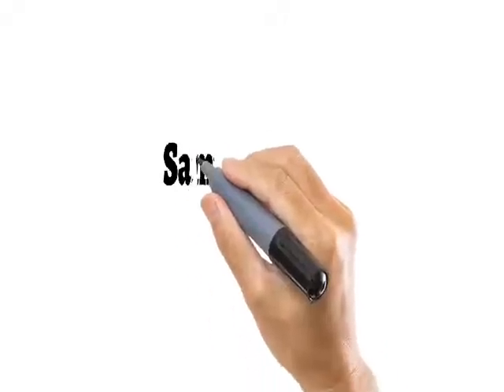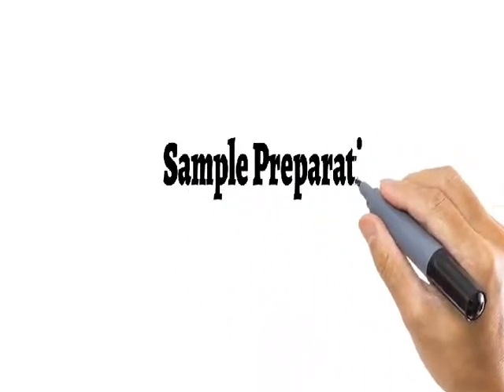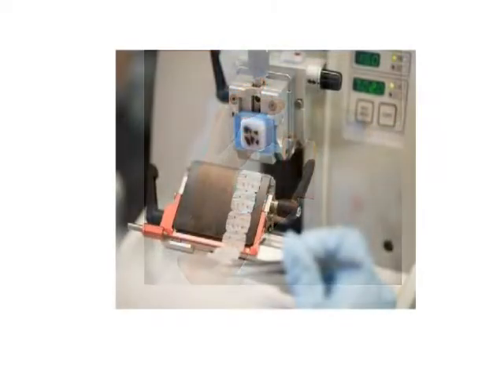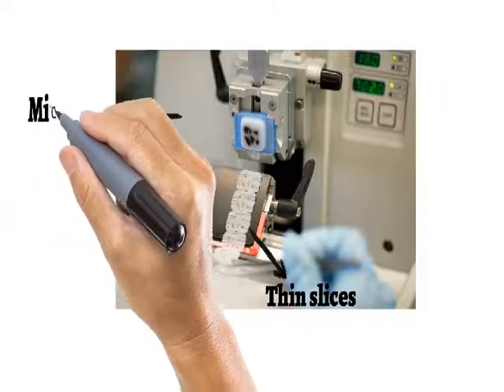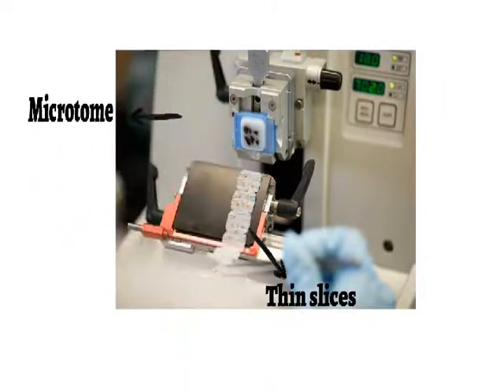Now we will see the actual protocol. The first step is sample preparation. In sample preparation, the target tissues or target cells are embedded in paraffin wax like this, and after that very thin slices are prepared using an instrument known as a microtome. So here you can see the microtome making very thin slices of that particular tissue.